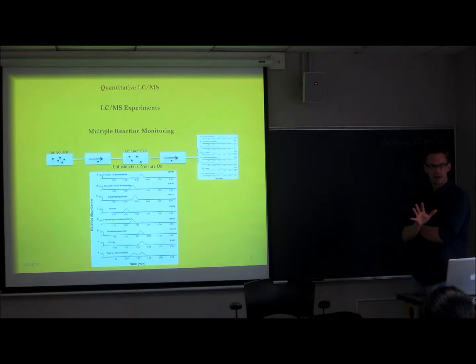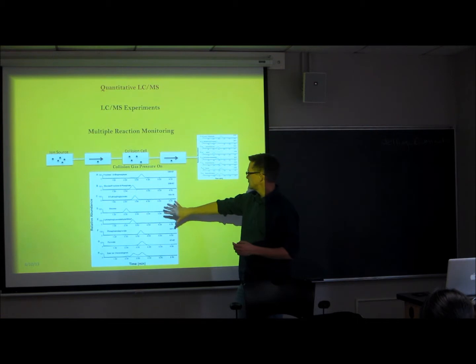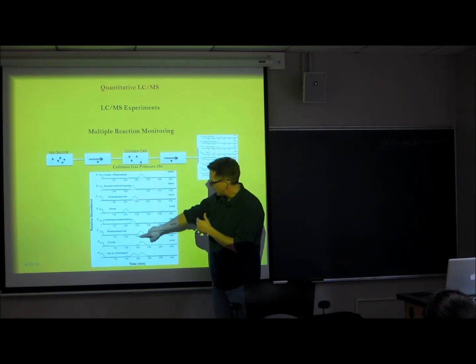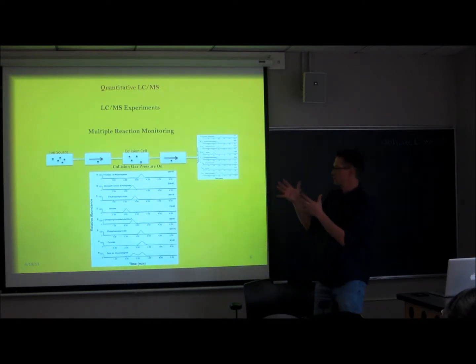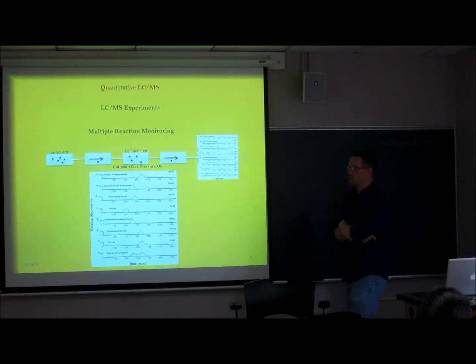Any questions on that? That's how you think about setting up the mass spec portion of an LC-MS/MS experiment. You can be a lazy chromatographer in a lot of cases, because we have 2 dimensions of mass separation using the mass spec, so we don't require perfect chromatographic separation of these analytes, which we certainly do not have in this case. Even though they're co-eluting, you've got 2 dimensions of mass selectivity, so you still get a peak that's very specific to the compound of interest.